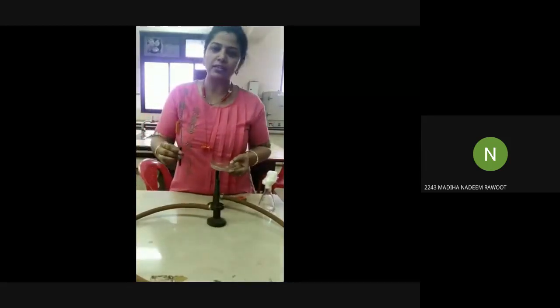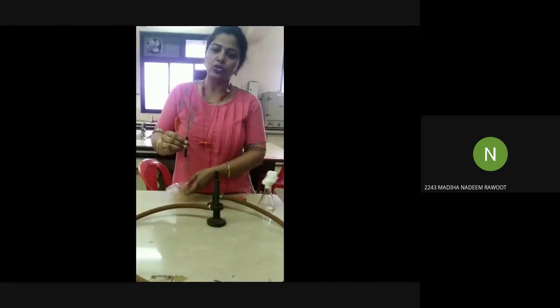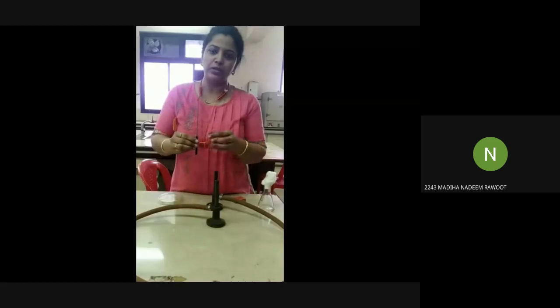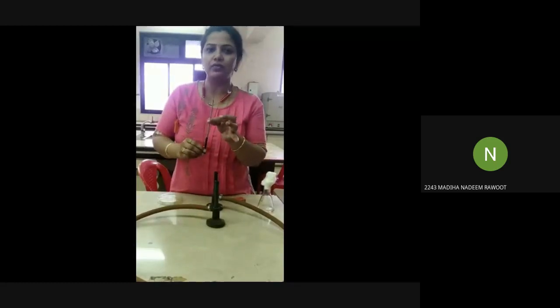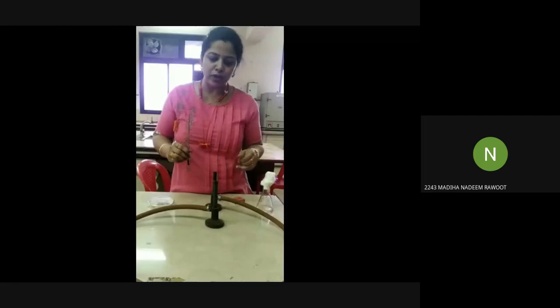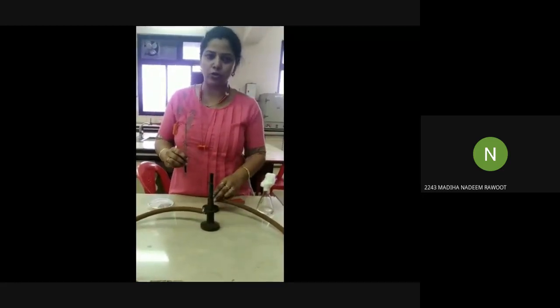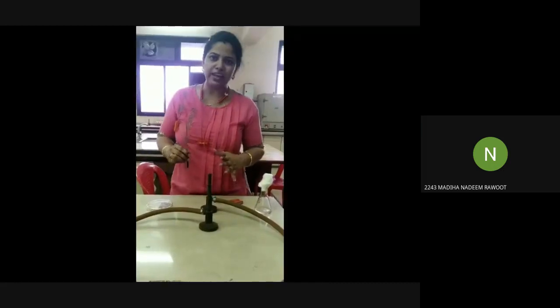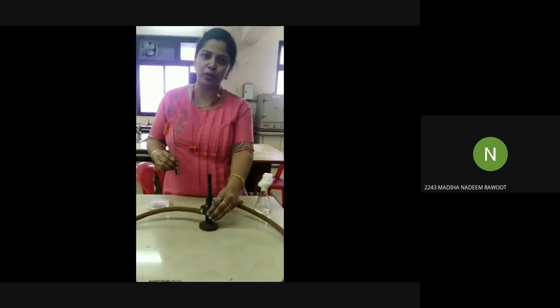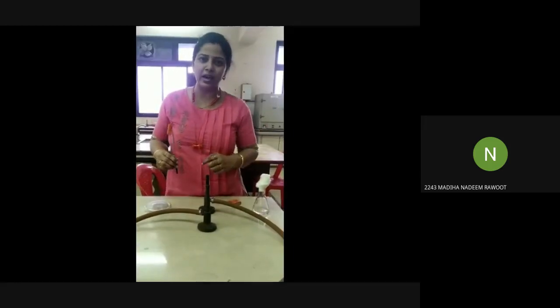This is called a nichrome loop. This is an inoculating loop. This is the equipment that we use to transfer any of our cultures directly from plates to either a suspension or onto slides. First I'll be telling you how to work aseptically also. When I say aseptically, it means working between these two burners. When we light the burner, the temperature around that area increases.